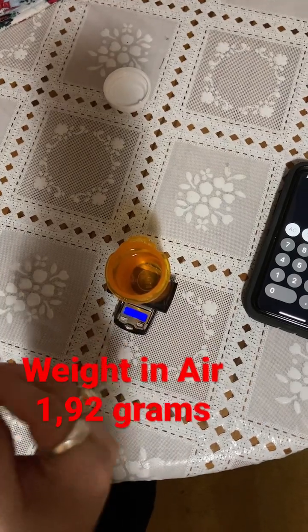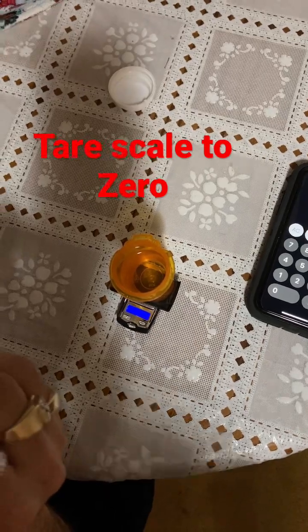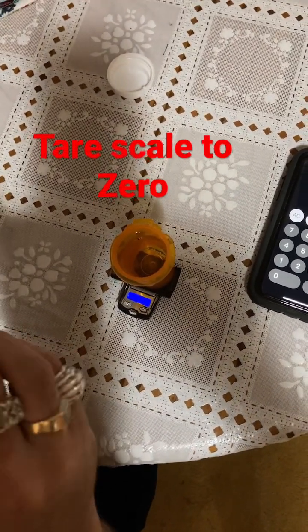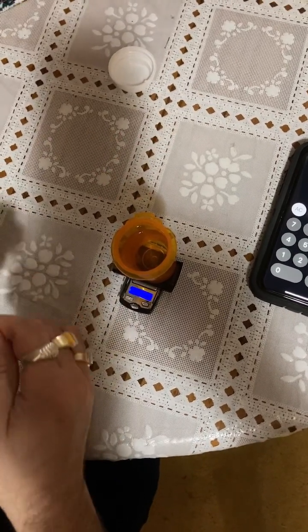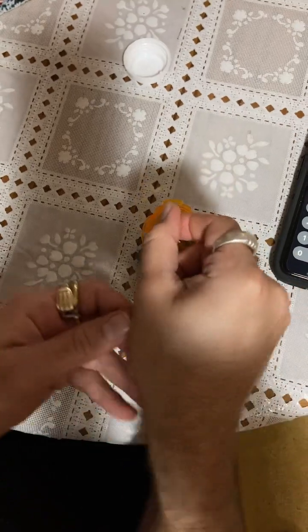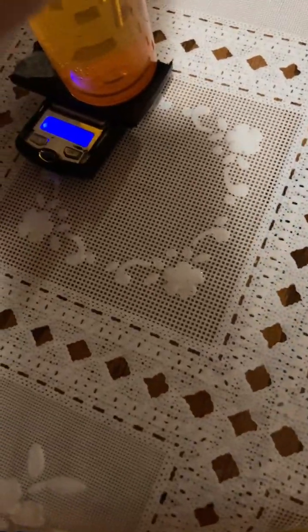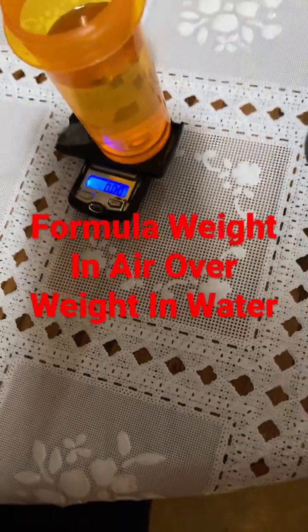Now I'm going to get the density in water. I have my string here and I'm going to submerge it in water. Make sure there are no air bubbles — and the reading is 0.1 gram.